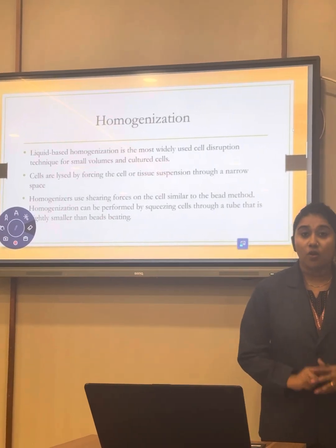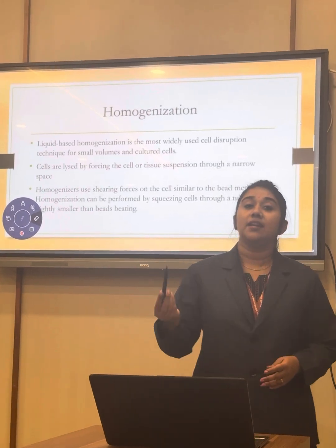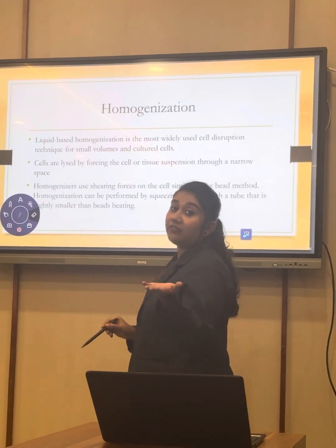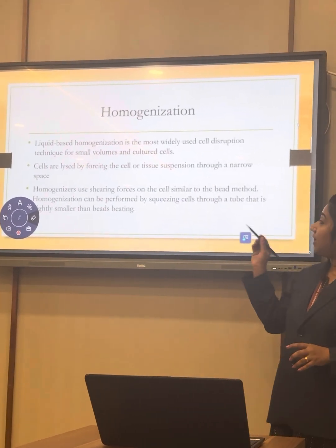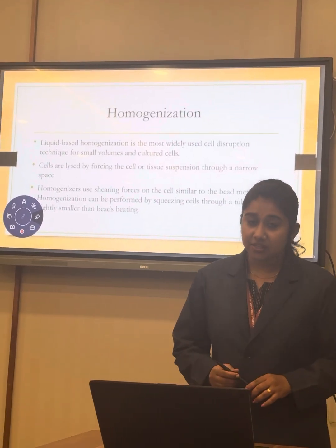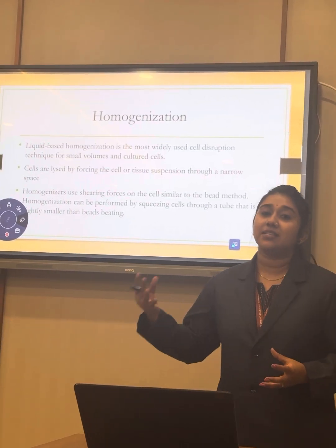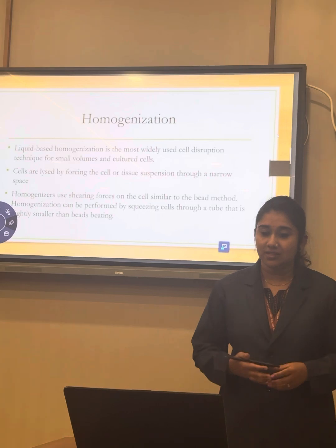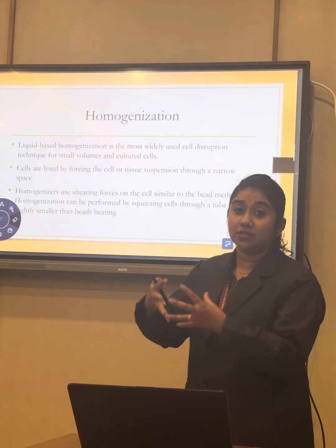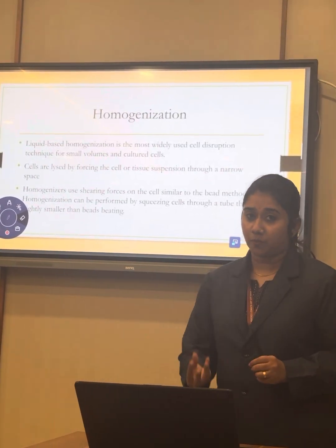Next we are discussing the homogenization process. It is very familiar to our students because in earlier food and microbiology classes you already studied this part, like in milk. Next, we commonly use liquid-based homogenization for small volumes and cultured cell disruption. The cells are lysed by a mechanical force. It disrupts the cells through a narrow space.